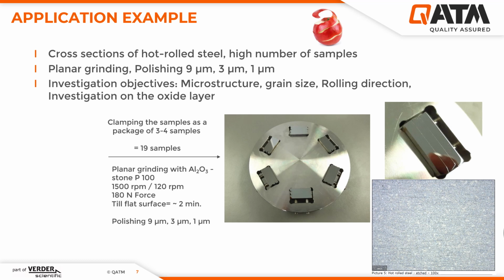The pressure was set at 180 newtons and the sample holder was ground planar within 2 minutes. On the right side, you can see what the sample packages look like, as well as the microstructure after 1 micrometer polishing and etching with 3% alcoholic nitric acid.